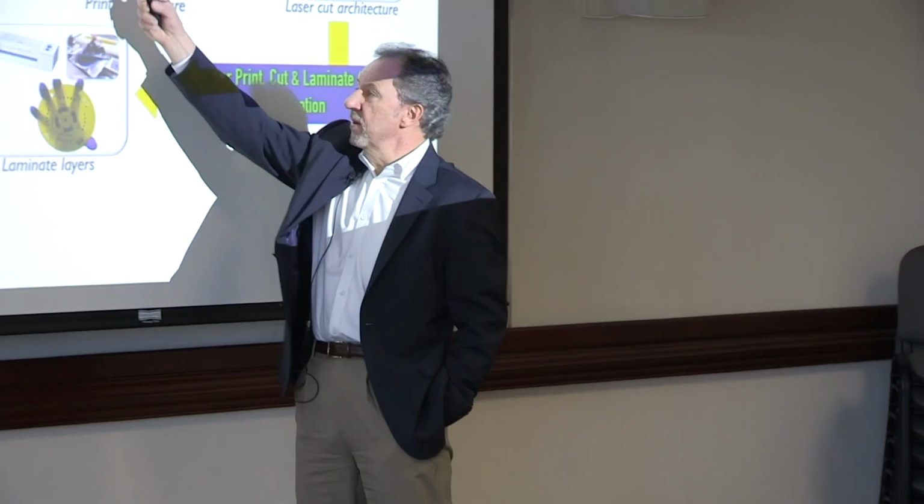So how did we take a new approach? We divided this into chipware, hardware, software, and chemware. And it's only these two that I think are worthy of talking about today. If you're going to change up the chip, you're going to have to make it inexpensive. So we actually fabricate these chips by using overhead transparencies because they are available, or were available, and inexpensive. We actually use relatively simplistic instrumentation to fabricate these. So we use a laser cutter, which is nothing more than a trophy etcher, and we use an office laminator. And if you now coat some of the sides of the microfluidic disc with toner, when you assemble that and put it through an office laminator, the toner melts and becomes a glue. So it allows you to do a relatively simple fabrication.